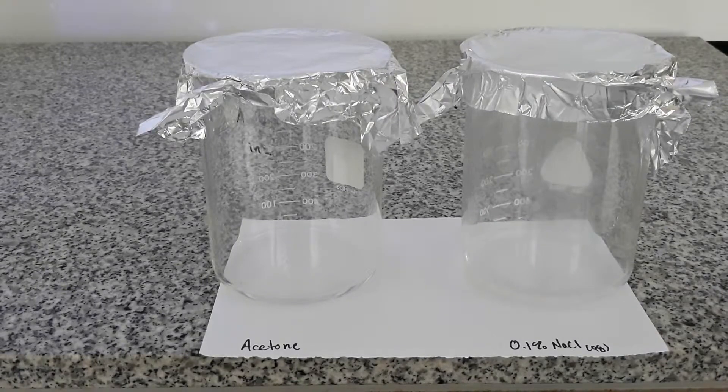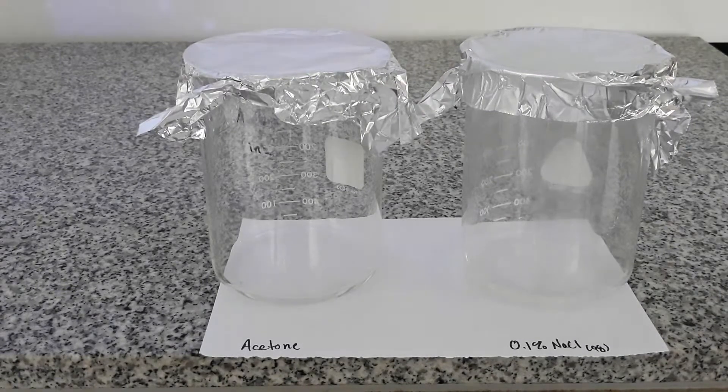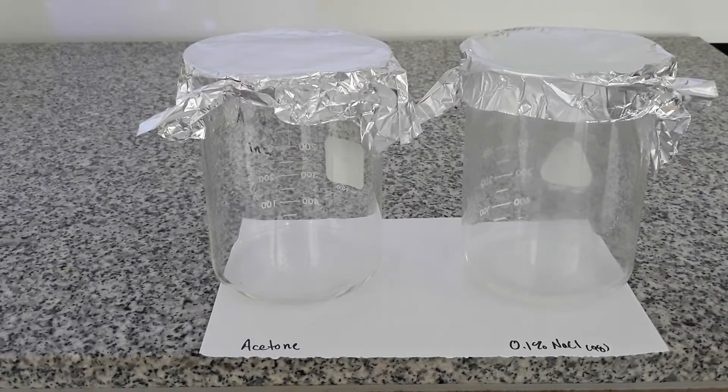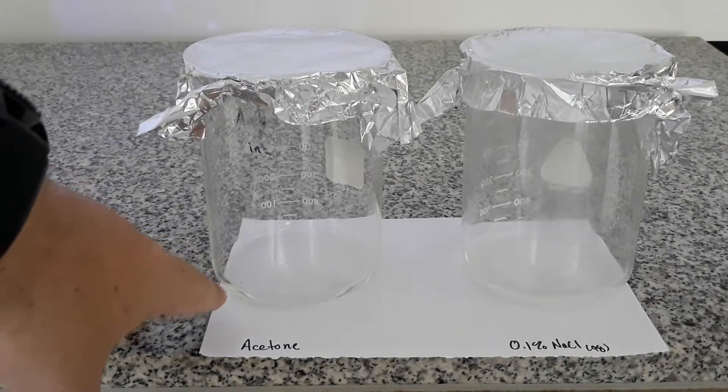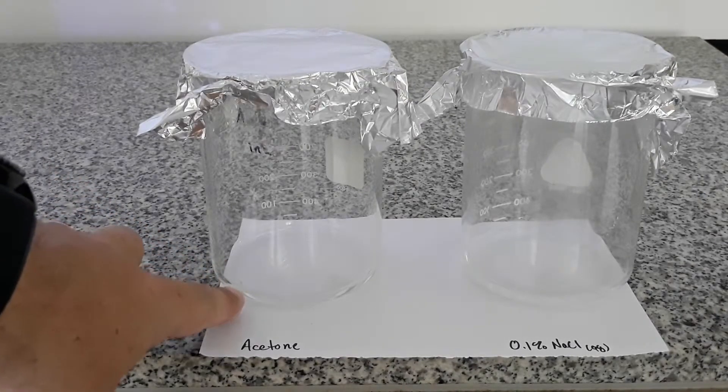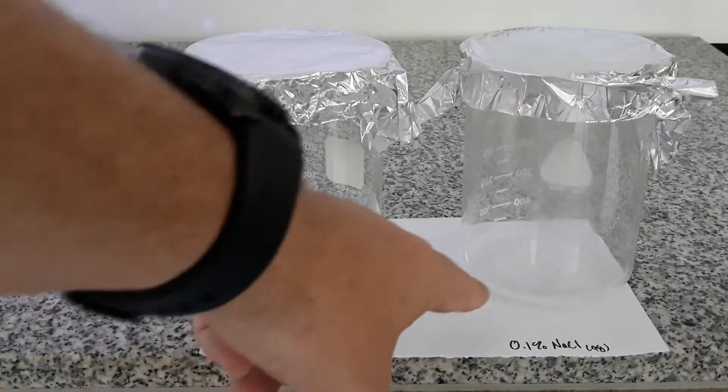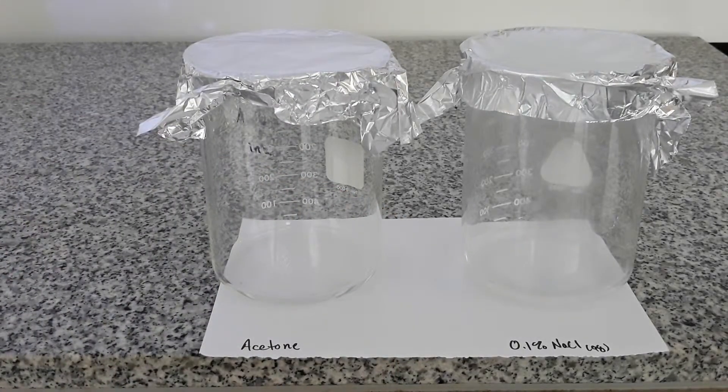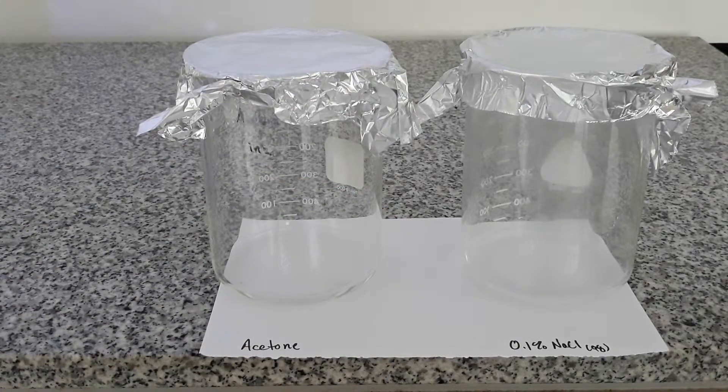Off screen I set up a second page identical to the first for our sodium chloride run. Here we have our development chambers. On the left we have acetone. There's just a little bit of acetone in the bottom of the beaker. On the right I have a 0.1% sodium chloride solution.